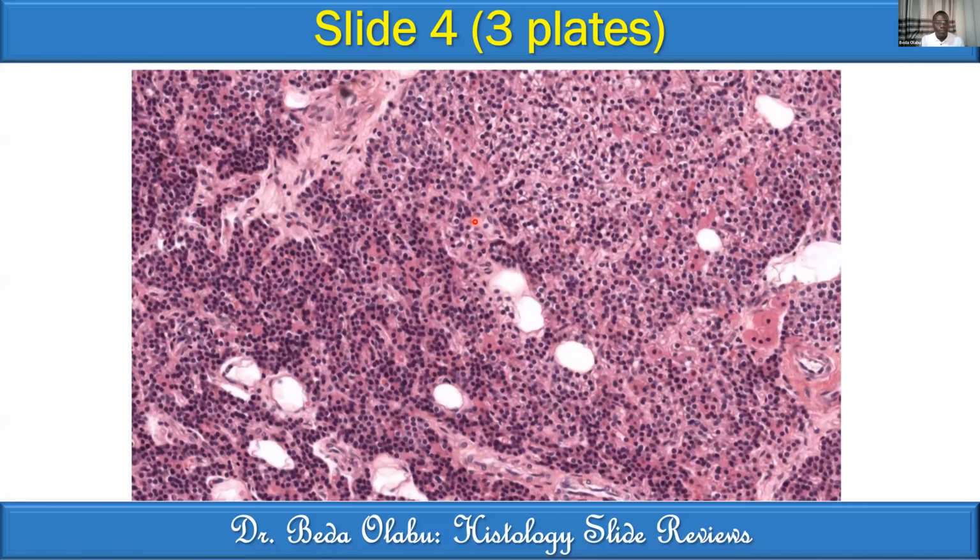From here I can see the adipocytes, the white cells. They are visible, and maybe the clear cells are also visible together with the adipocytes. Fair enough. Very good. Anyone else want to add to what Harrison has said before we take it up?